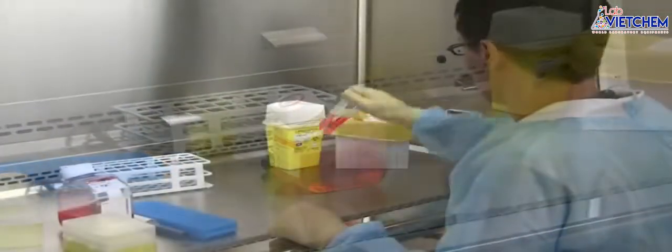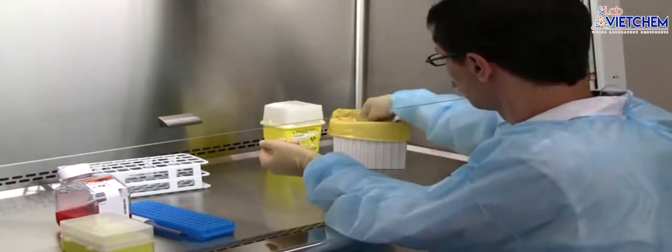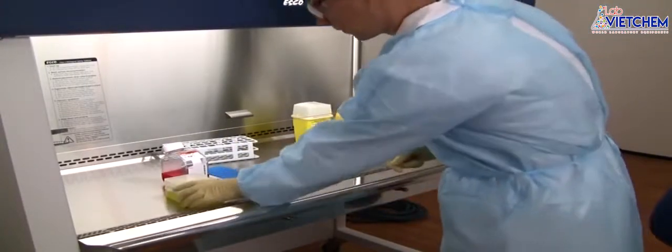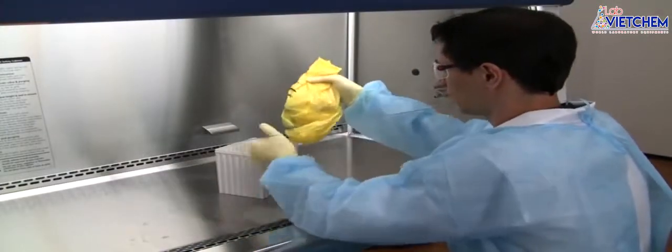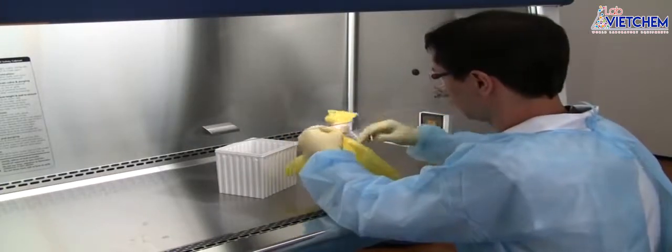Place all waste in the discard container within the biosafety cabinet. Remove, discard, and then replace your gloves. Then remove all the items that have had their surfaces decontaminated. Remove any waste, disinfect, and autoclave, or place in the appropriate waste stream.